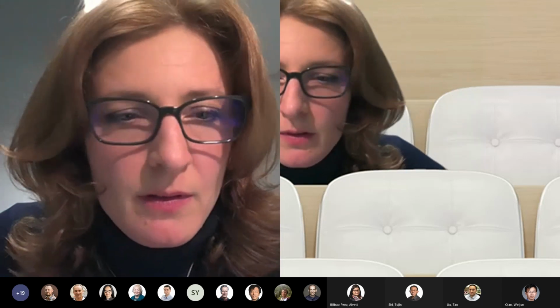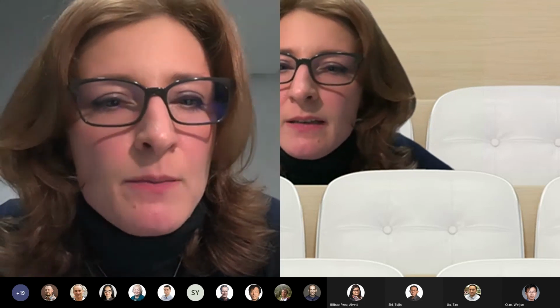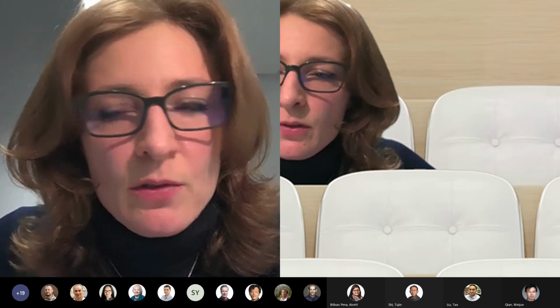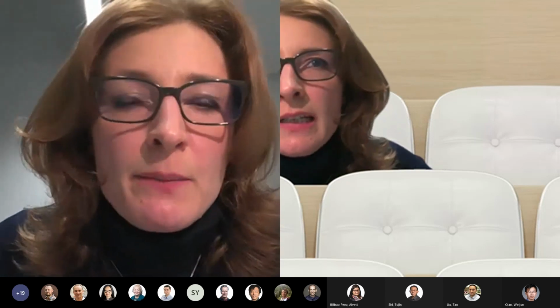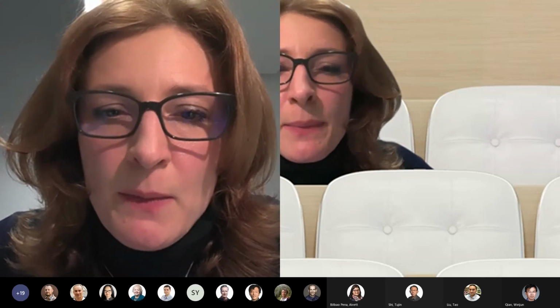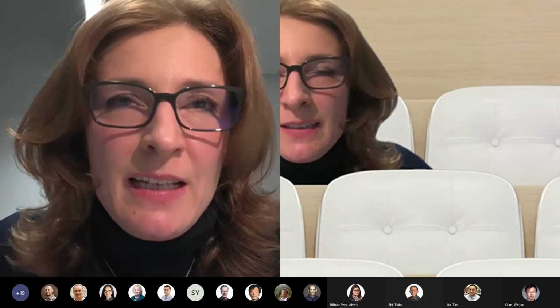Yeah, that's right. So no, we didn't compare, so I wouldn't dare to make conclusions on the respective coverage. It seems that at the moment it's still slightly lower, but I don't think the same system has been analyzed with both techniques. But I personally think that cross-linking is going exactly in that direction, and I would love to be able to combine LiP with cross-linking, maybe surface labeling as well. They are all techniques that can probe protein structural changes. I don't think the future is necessarily doing LiP analysis, but I believe in the power of detecting altered structures with whatever method. So probably cross-linking will get there very, very soon.